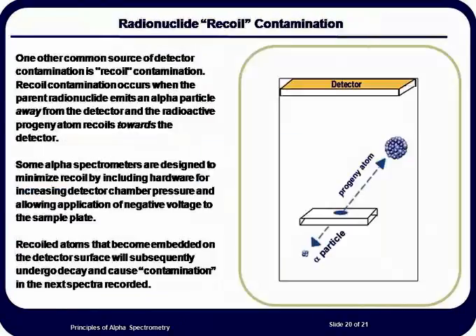The background counts for an alpha detector over the entire energy range theoretically should always be 0. This is because the shielding provided by the detector's vacuum chamber will stop any alpha particles from the environment from entering the chamber. Thus, the principal sources of background are electronic noise and contamination. The electronic noise is minimized by the instrument electronic specifications and the control of the line voltage to the detector. The chamber contamination is controlled by the chemist.